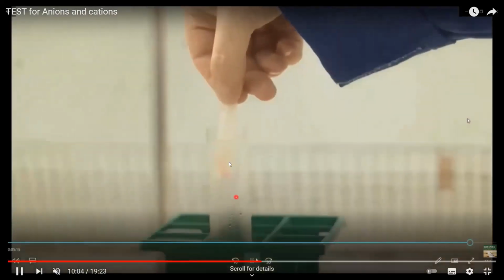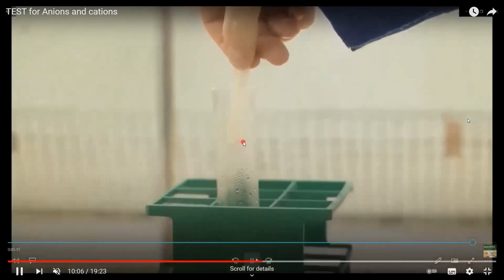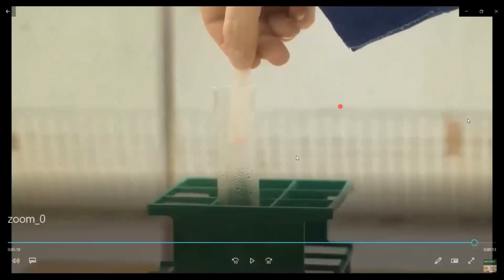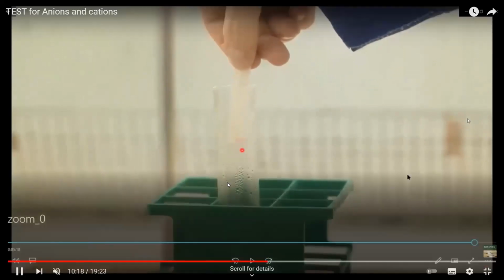This purple color will disappear. You can see when you open, the purple color changes to colorless. This confirms that the gas released here was sulfur dioxide, and the ion present was the sulfite ion. Sulfite ion means SO3.